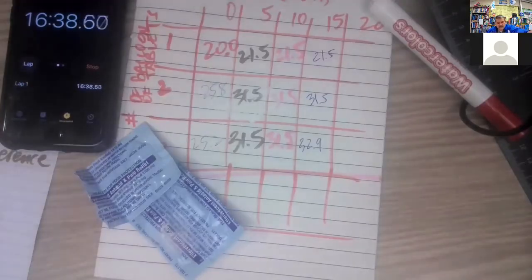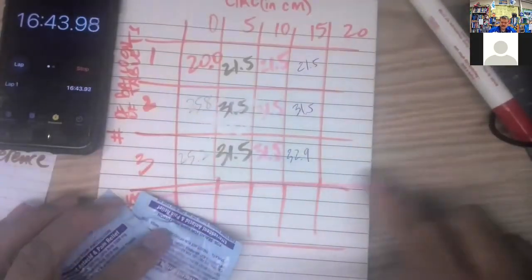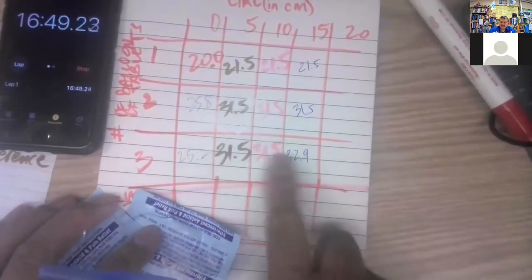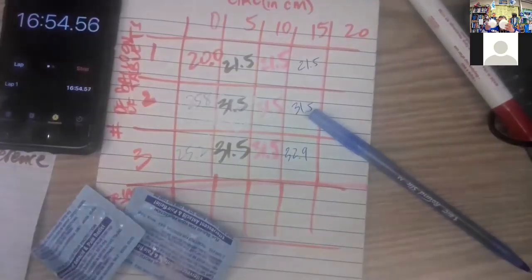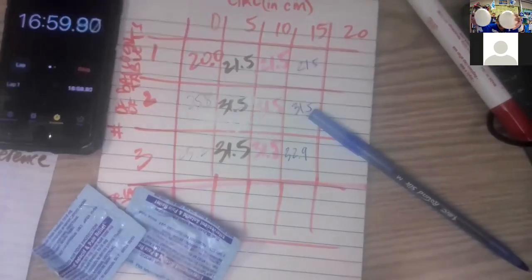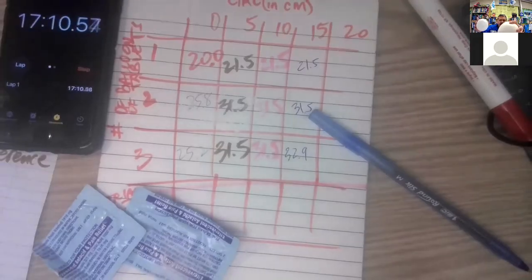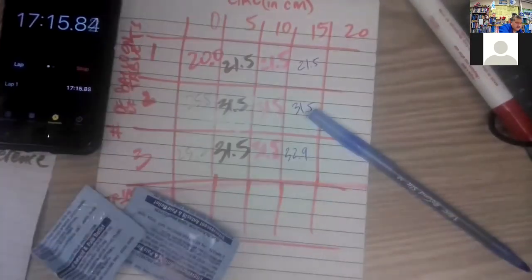Okay, so we'll take another measurement at 20. Be interesting to see if that third one goes any higher than that. It didn't move between 5 and 10, but it did get just a little bit bigger. Now you look at them on the small screen. They look about the same to me, but this one is not quite spherical, right? And maybe it's just the bump that did it. I don't know.